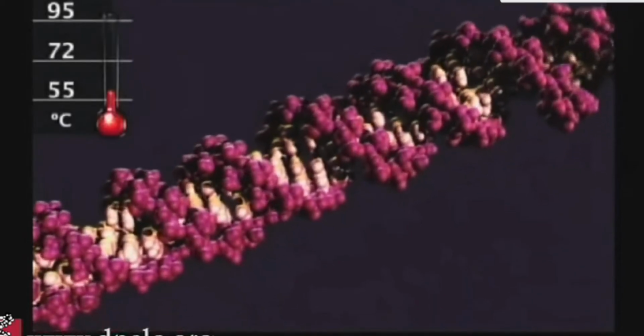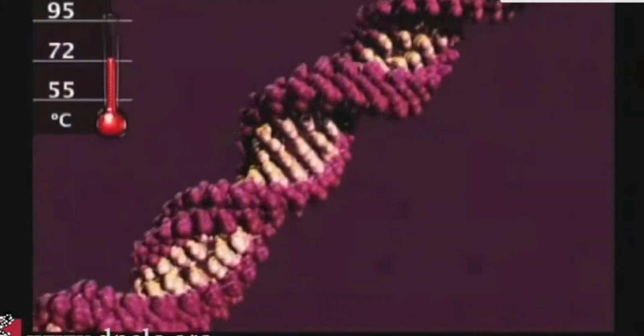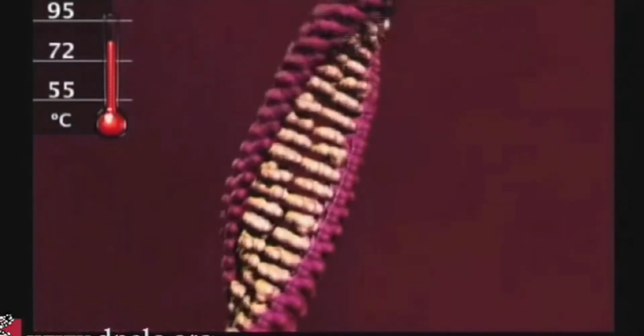Today I'm going to speak about PCR and its applications. Polymerase chain reaction, or PCR, uses repeated cycles of heating and cooling to make many copies of a specific region of DNA.